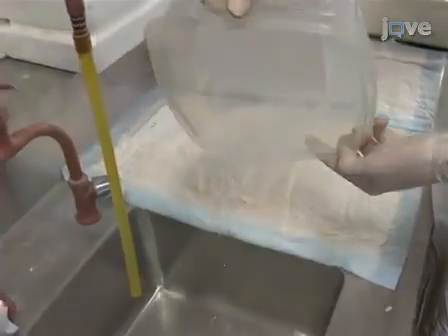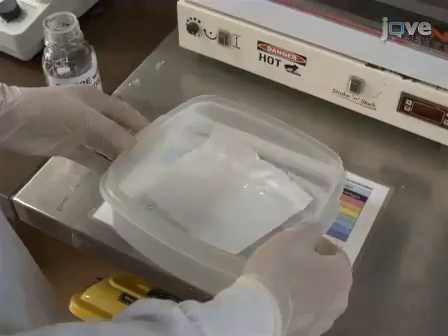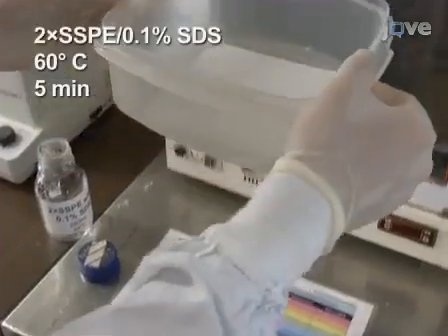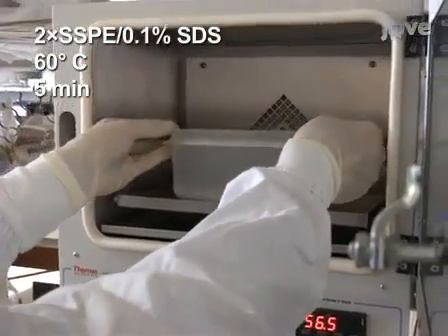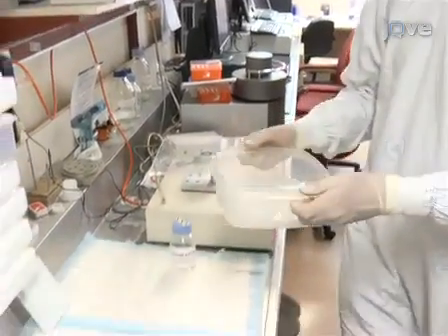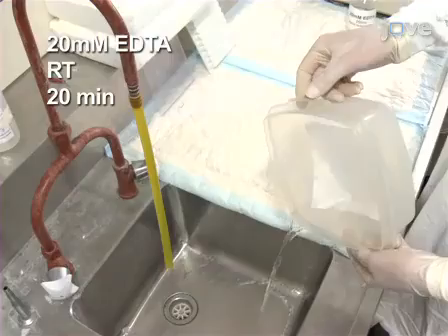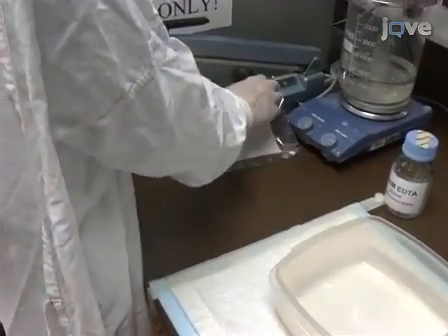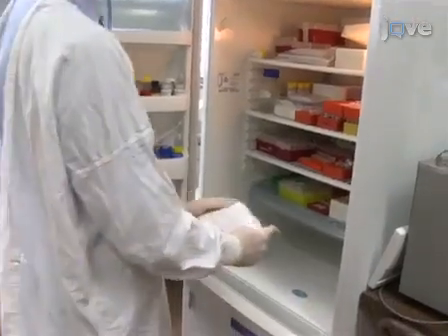Wash the membrane in 250 millilitres of 2x SSPE for 30 seconds. Then wash it in 250 millilitres of pre-warmed 2x SSPE, 0.1% SDS in the oven at 60 degrees Celsius for 5 minutes. If not immediately being used for hybridisation, wash the membrane in 240 millilitres of 20 millimolar EDTA at room temperature for 20 minutes, then seal the membrane in a plastic bag with the remaining 10 millilitres of 20 millimolar EDTA and store at 4 degrees Celsius.